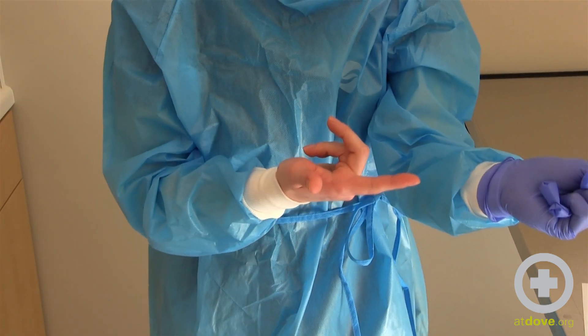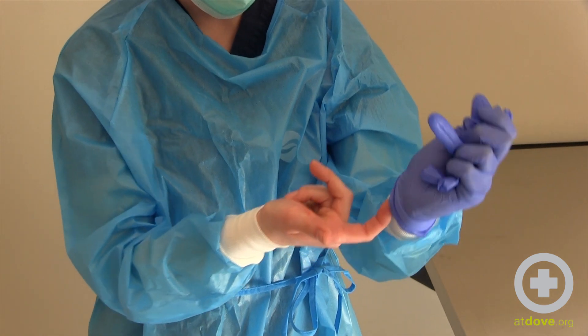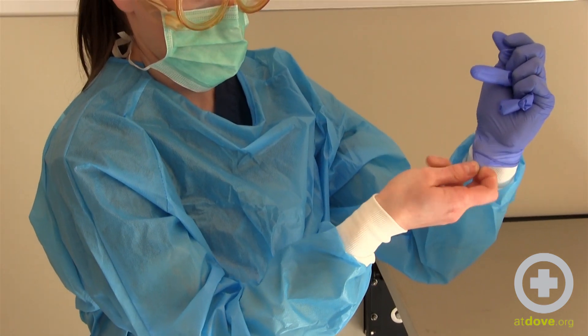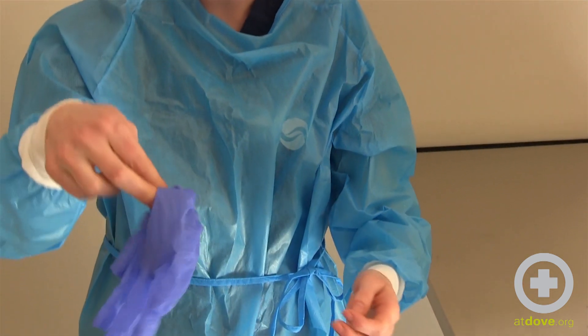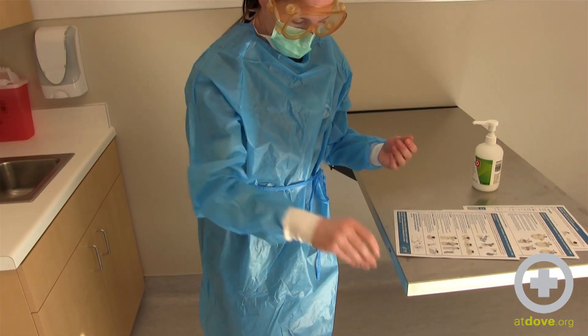For the second glove removal, I've just exposed my clean cuff of my gown. I'm going to carefully slide my finger underneath into the clean part and then carefully work that off. Now my gloves are inside each other, turned inside out inside each other, and into the garbage.